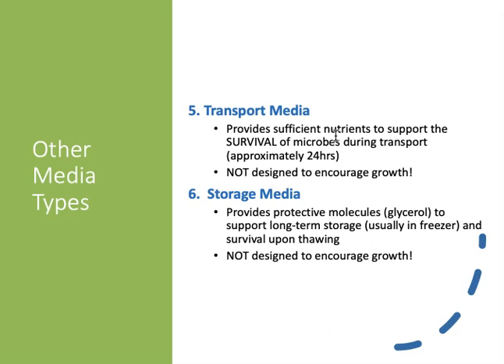So transport media is designed to keep the cells alive, but not allow them to grow and divide. It's important, of course, that the companies that transport these samples between a physician's office or a hospital and the microbiology laboratory are able to deliver within about 24 hours. Because if they get out much past that, if you get to 36 or 48 hours, the transport media won't keep the cells alive. The last type of media on our list is storage media.